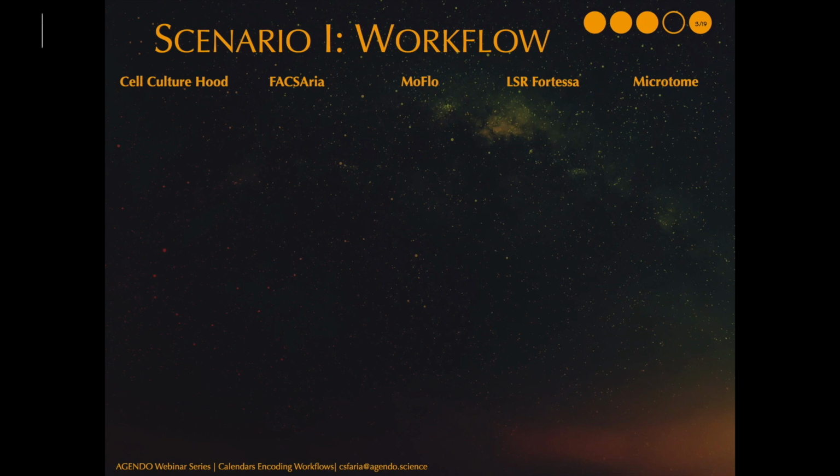Now, I want the cell culture hood to be a simple equipment which my users can use alone, assuming that they all know how to use a flow hood and how to keep it clean. So I don't want any restrictions here. So let's call it Book at Ease.